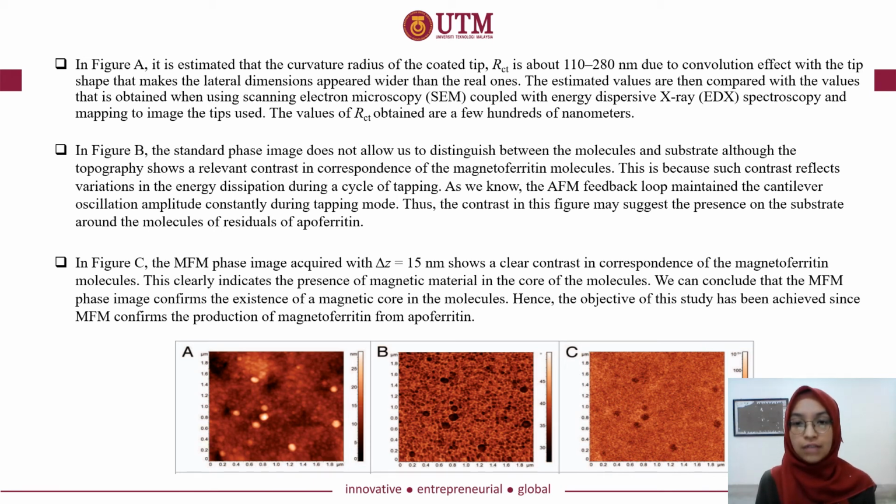The estimated values are then compared with the values obtained when using SEM, scanning electron microscopy, coupled with energy dispersive X-ray EDX spectroscopy and mapping to image the tips used. After that, the values obtained are a few hundreds of nanometers.